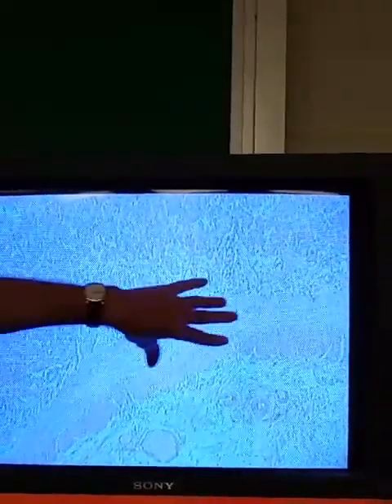And then down here we get a glimpse of it. We're out of gastric glands. There's your muscularis mucosa. So from there up, that's the mucosa. This is our submucosa. And then we go farther down, and then our muscularis.